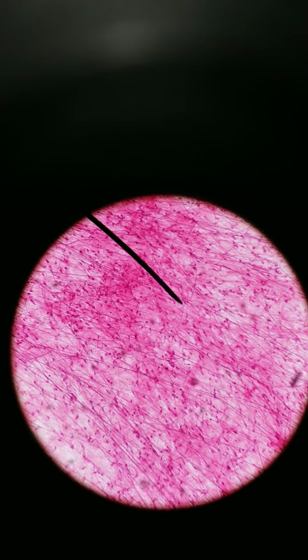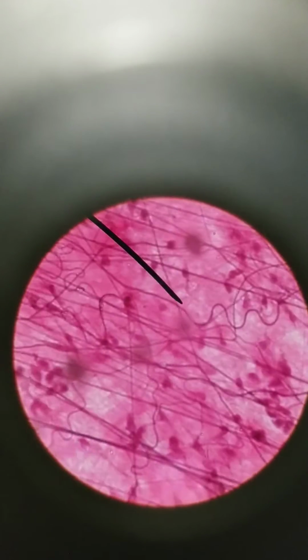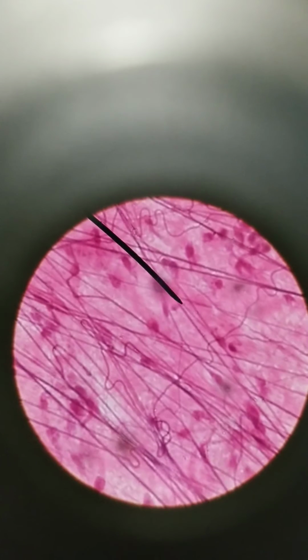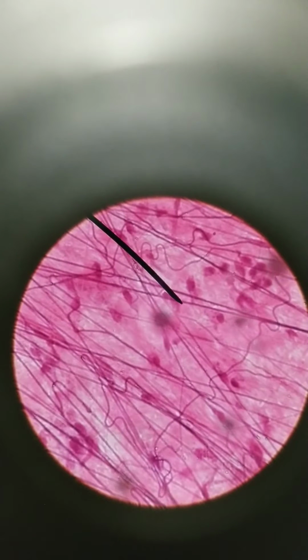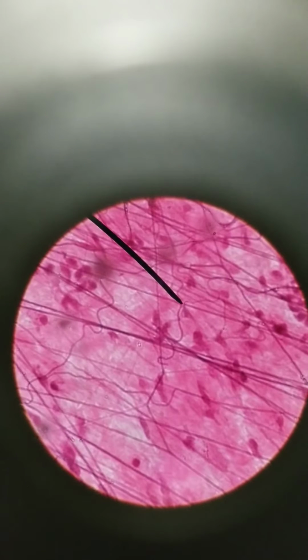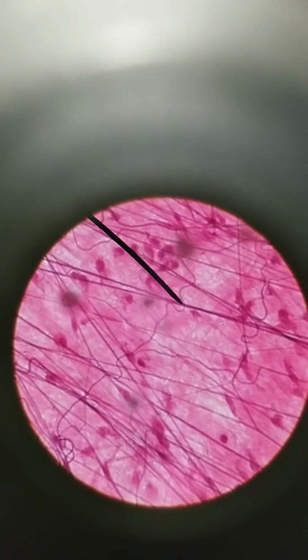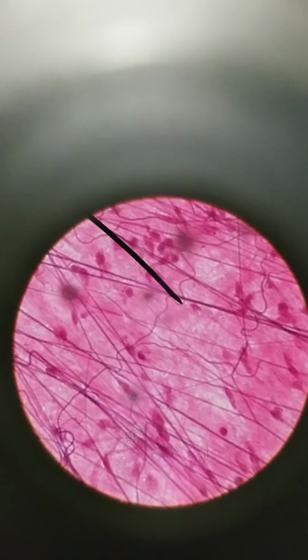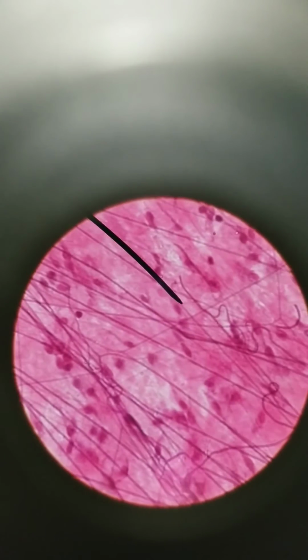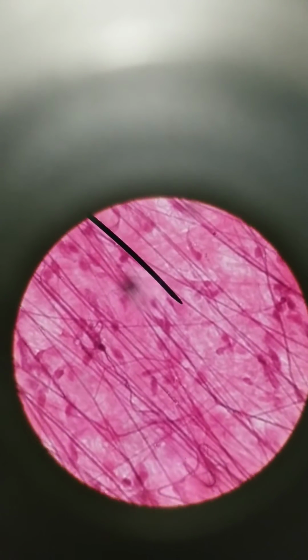Most of those nuclei you see are nuclei of fibrocytes. But all the squiggly things and lines you see, those are fibers. We said that there was collagen in between the adipocytes, excuse me, in areolar connective tissue. We've got 3 fiber types. We've got collagen, which is long and straight. The wavy one that you see, that is elastic fiber, and so elastic fiber, as you might imagine, is stretchy. And then we're looking for dark branched ones. Dark branched ones are reticular fibers.